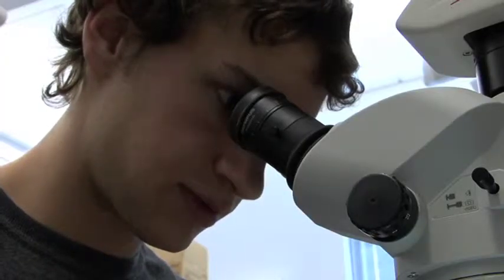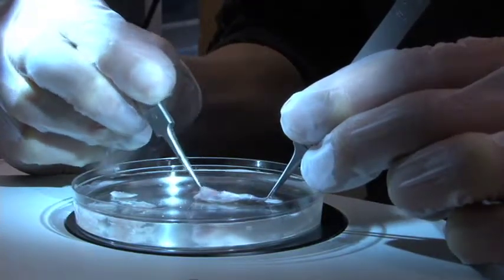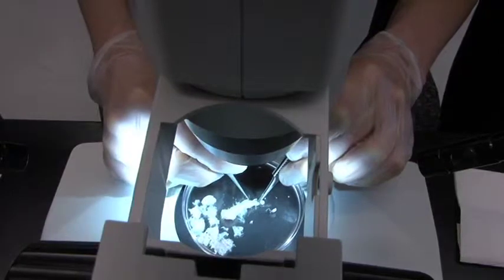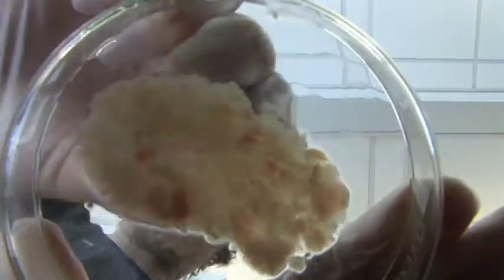The satellite cells, shown in green, are moving on muscle fibers shown in red. Satellite cells are harvested from the leg muscles of mice. Here the muscles are being separated from fat, bone, and other tissues. The muscle must be chopped to allow the target cells to be filtered from unwanted cells.